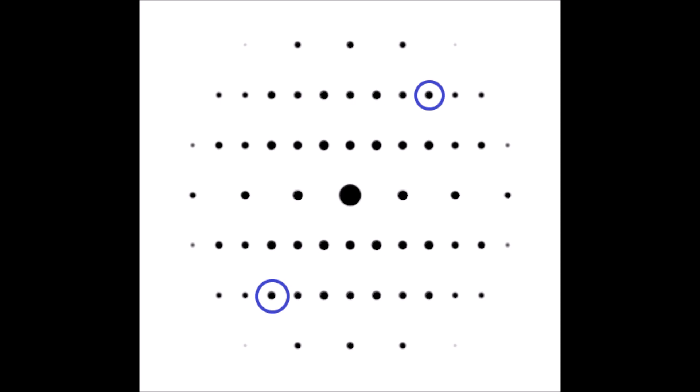And so depending on how far off of the zone axis I am, I may actually even see a ring or a circle, which we call a Lowey circle, form in the diffraction pattern, which again is an extreme example of what happens when you're not aligned with the zone axis.